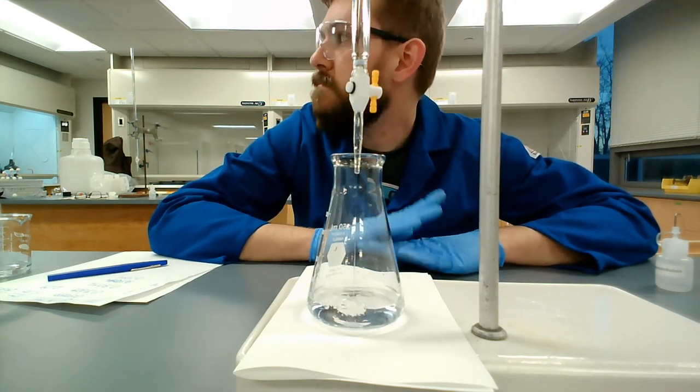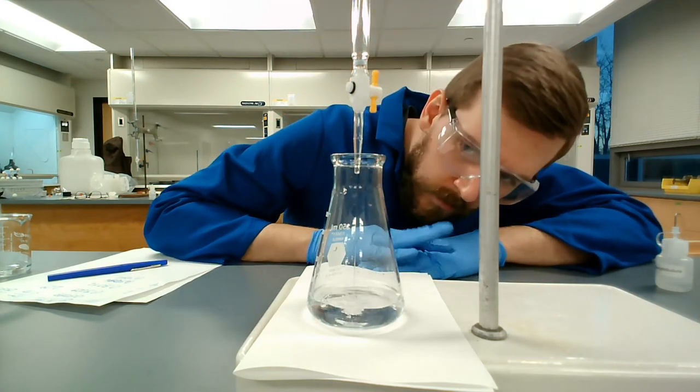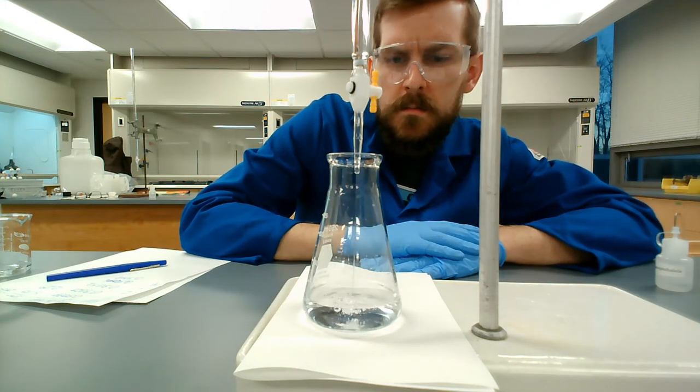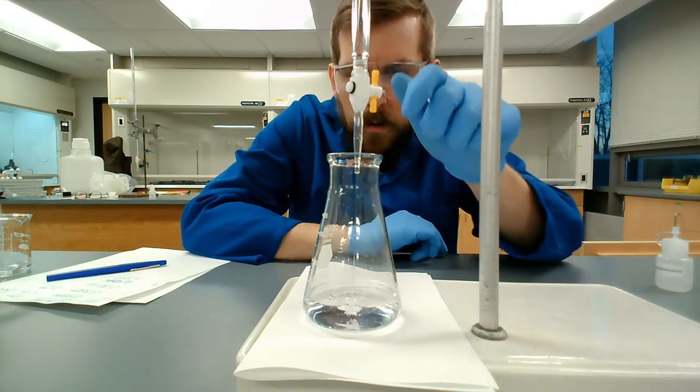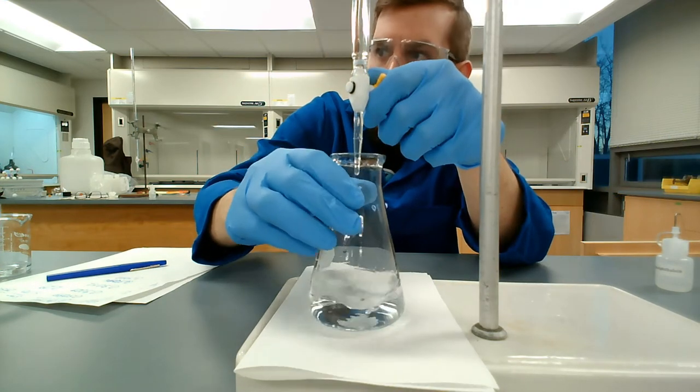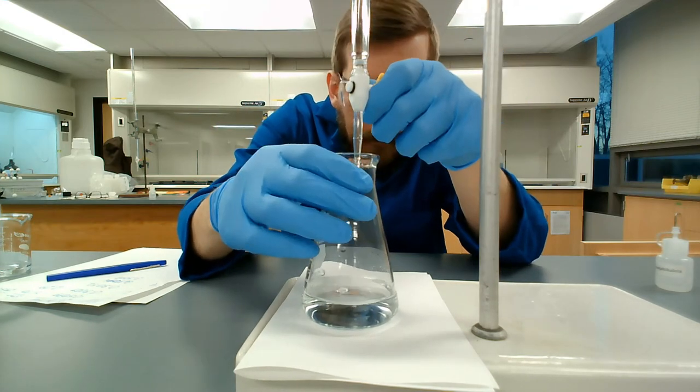The rest of this video, by the way, is just me sort of going through the remaining three titrations. I think it's still worth watching. I think I screw one up. So, you know, there are important technique lessons to learn in the rest of this video, but they're kind of repetitive. Again, I start fast.